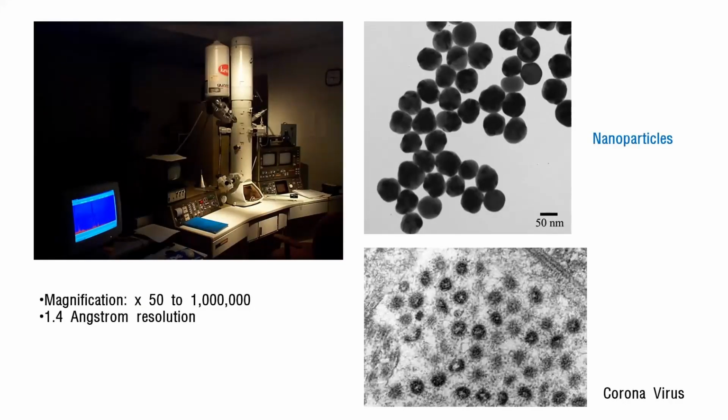This figure shows one example of TEM, and the magnification of this TEM ranges from 50 to 1 million, and the resolution is 1.4 angstrom.